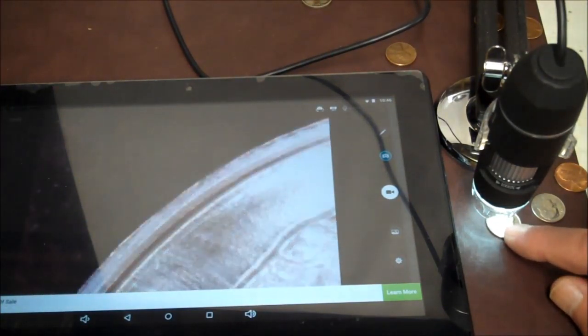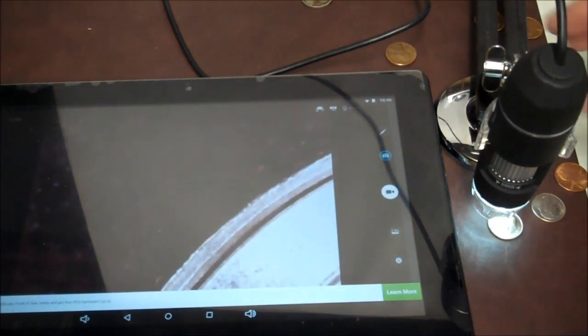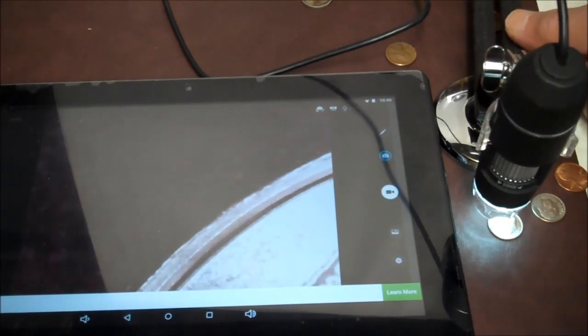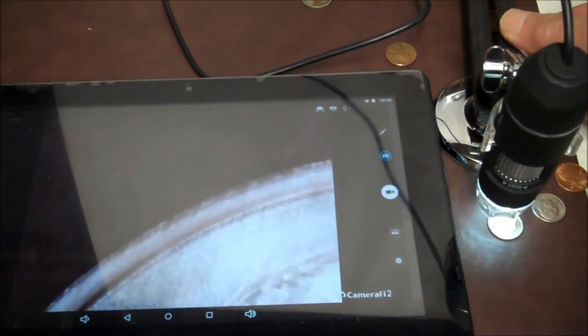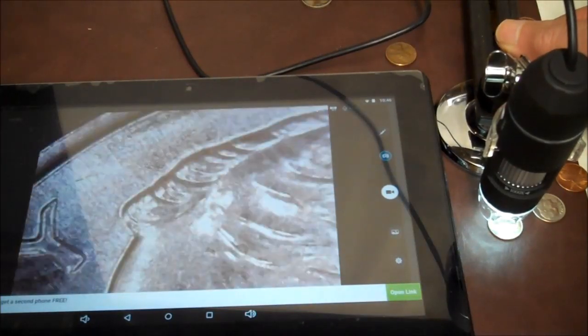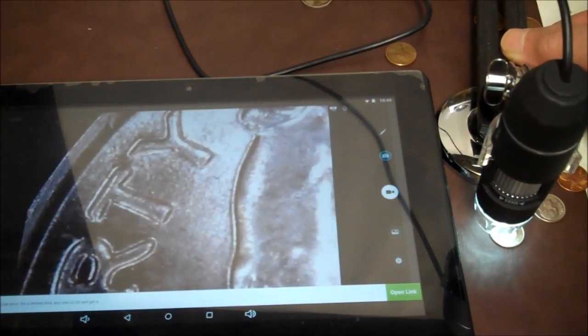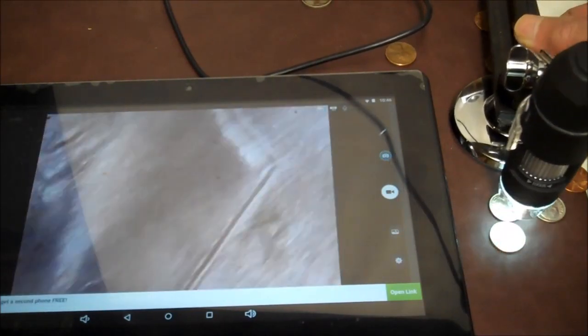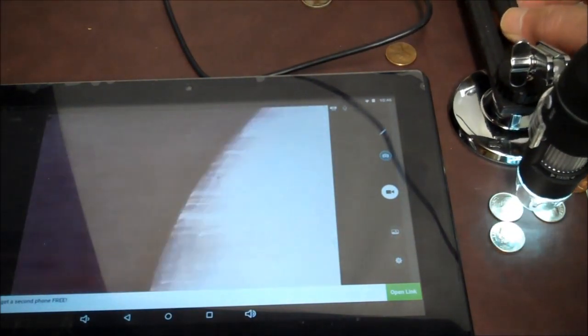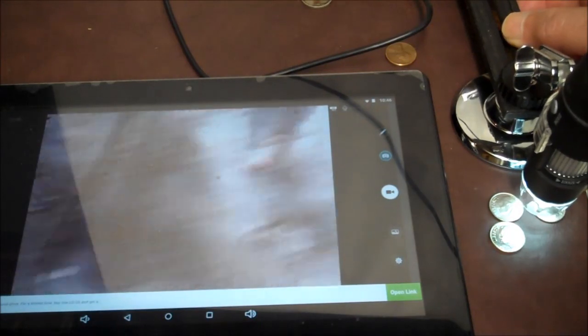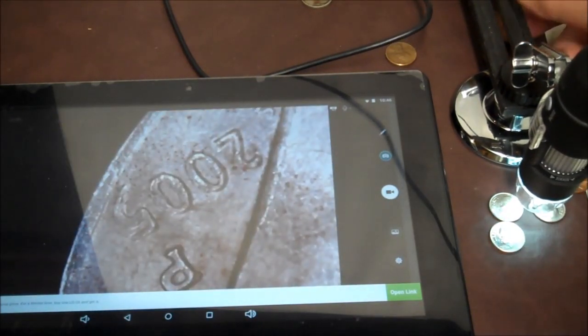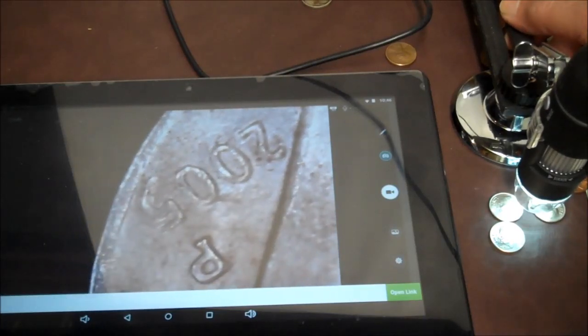Anyway, if you buy one with this cheap stand, if you can think of a way to counterbalance it, like I did, you'll be better off. There you go. Or if you can make your own stand. I was gonna make my own stand, then I came up with this idea to counterbalance. And it seems to be working pretty good.